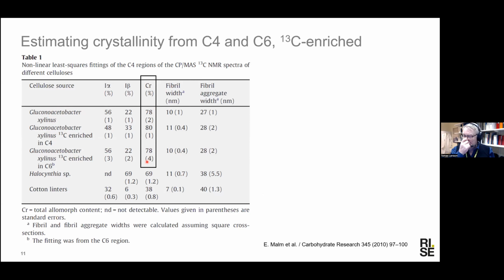And this has an implication. It says basically this, that any domain of polymer order, whether it's a surface or the crystalline interior, or paracrystalline or whatever, the typical domain size is large in some respect compared to the anhydroglucose unit. All the carbon atoms in one anhydroglucose unit sort of belong to one kind of ordered state.